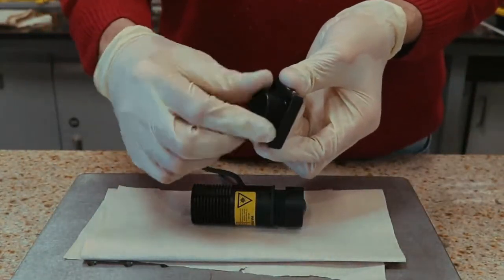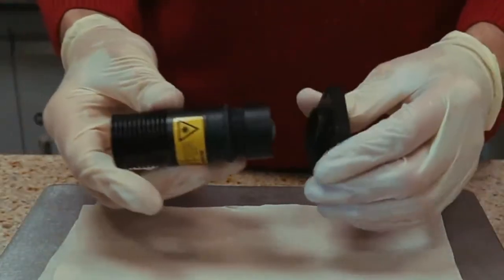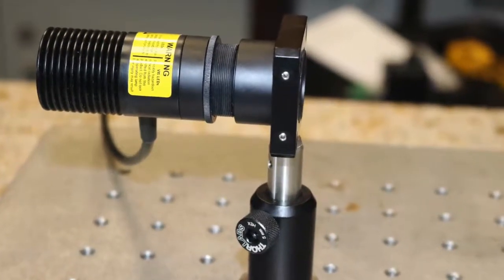Mount the LED on a cage plate and insert cage rods in this plate. At this point, you can mount the system on a post and post holder by attaching it to the cage plate for easier manipulation.